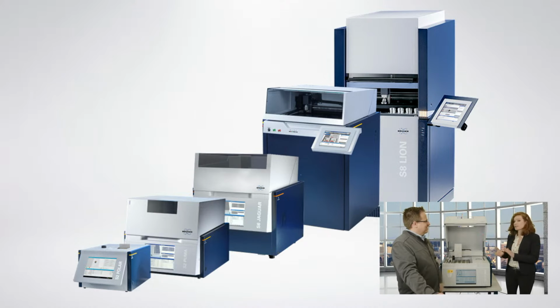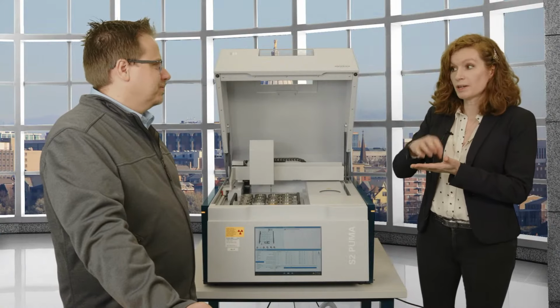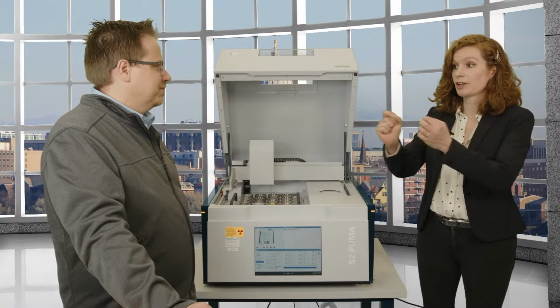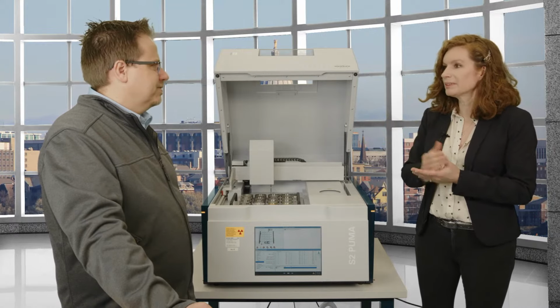So that's two machines, right? There is a WD machine that is actually simultaneous instead of sequential, so it is even faster. You put in one sample and it has several goniometers or several channels around it. So that's for the extra fast people.